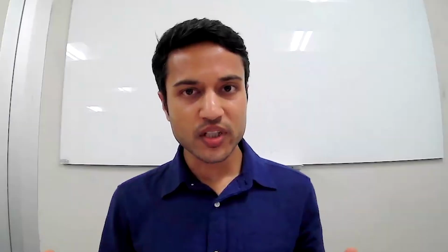Hi, I'm Shubham Khetan. I'm a postdoc in Dr. Martha Bulyk's lab. And as she mentioned earlier, the problem is that current high-throughput approaches miss a lot of the lower affinity DNA binding sites. And so we need a more sensitive, high-throughput technology to measure transcription factor DNA interactions.